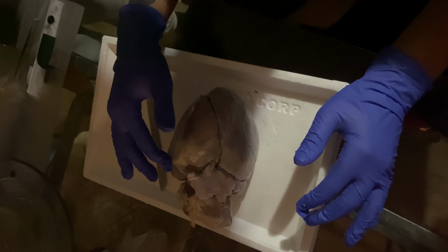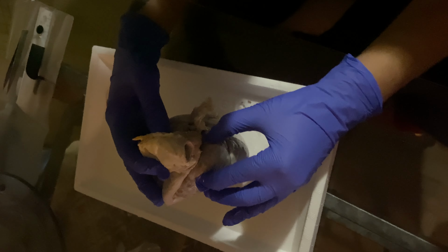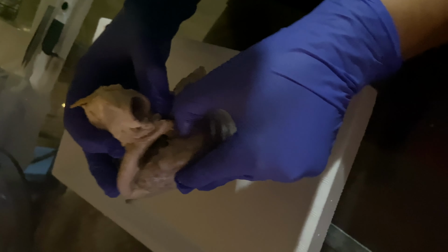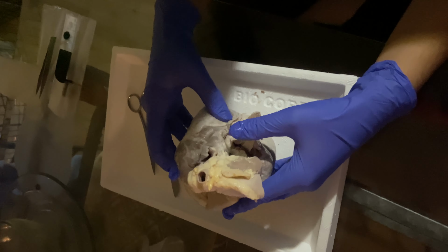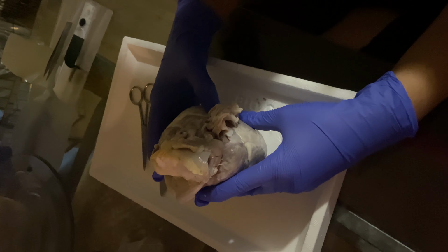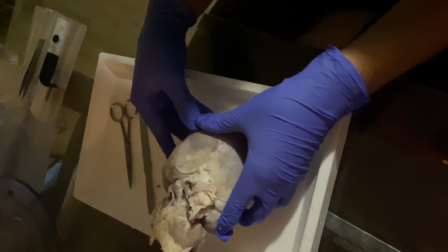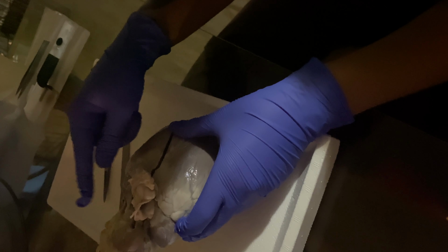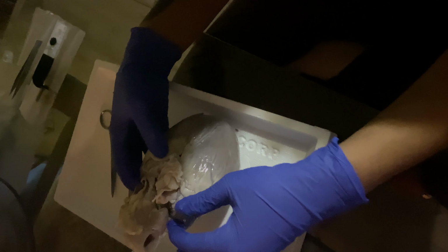Apex, the base. Pointing it like this, you can see that there is an auricle here, a little pouch right here that fills up when the atria fill up. And here's the other pouch. These are the auricles. Because this is oriented as if it's your patient facing you, this is the left side of the heart, and over here is the right side of the heart. Therefore, this would be the left atrium, the left auricle, and this would be the right auricle.